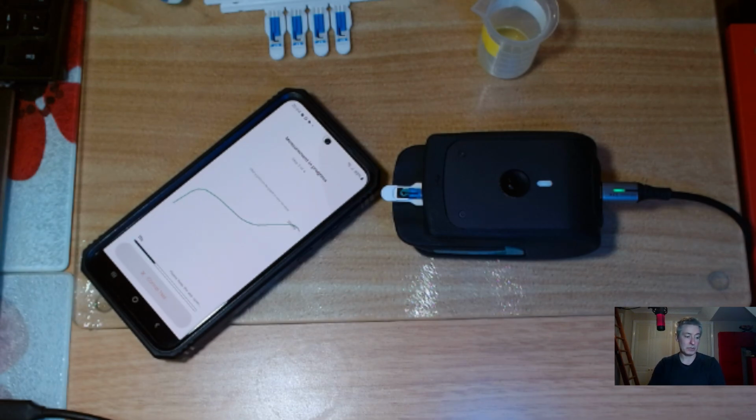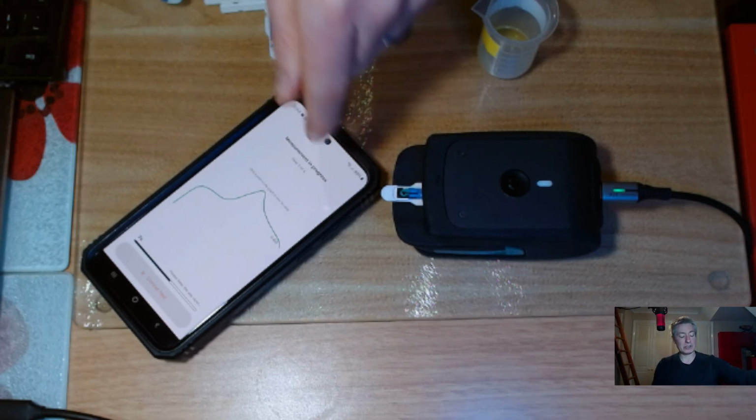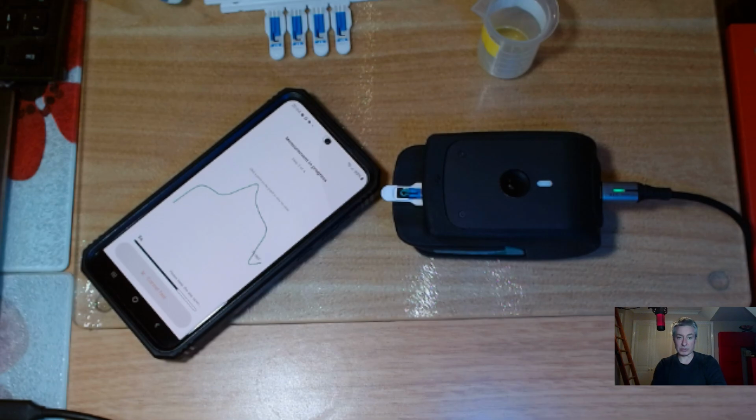There we go, we get the new peak. I hope, no, that's fine. And there we are. See, I get quite nice peaks here, so I suspect that cleaning step was actually quite a good idea. So this is just current versus time. Now it'll do experiment number 3.